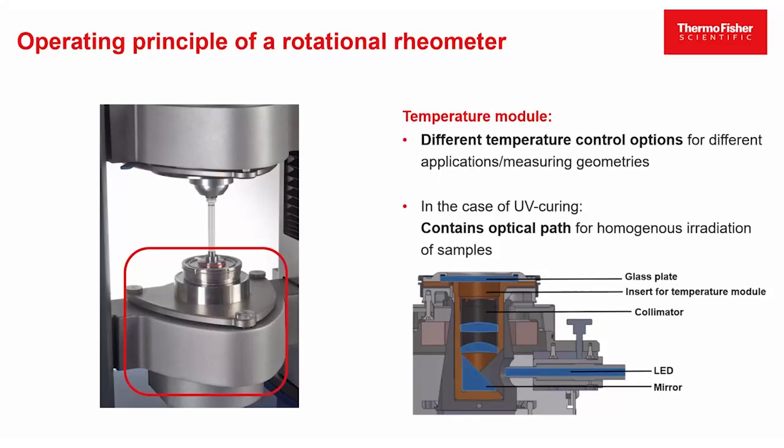As said before, a rheometer is a device that measures sample properties under defined conditions. One parameter that influences the flow behavior quite dramatically is the temperature. Therefore, there's a whole variety of different temperature controlled options available to meet the needs of different applications or measuring geometries.